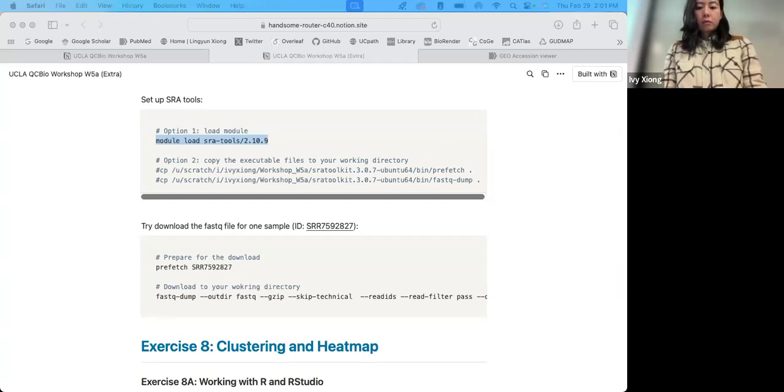And now you have to attach it. Okay, so you highlight this B, D, B, all the way up to interactive. So this one. No, the next one up. If you highlighted it, that's obvious. And now it's on this one, you write it.